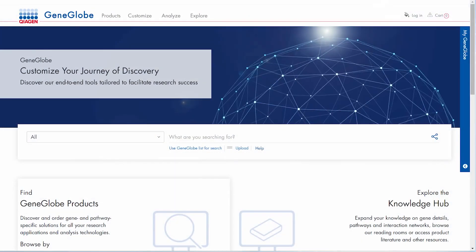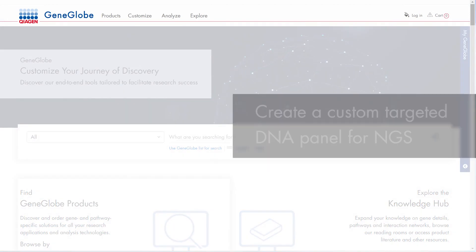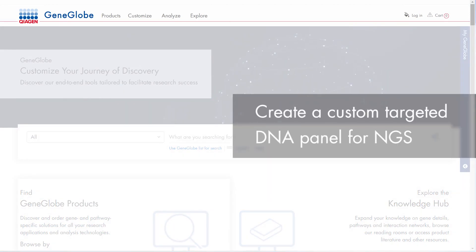In this demo, we will show you how easy it is to create a custom targeted DNA panel for NGS.